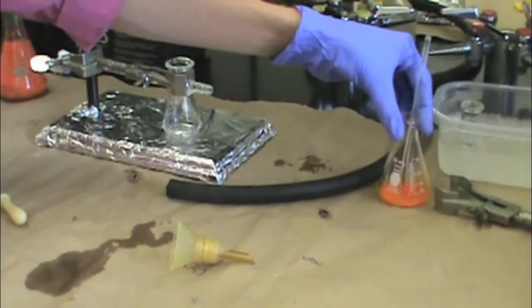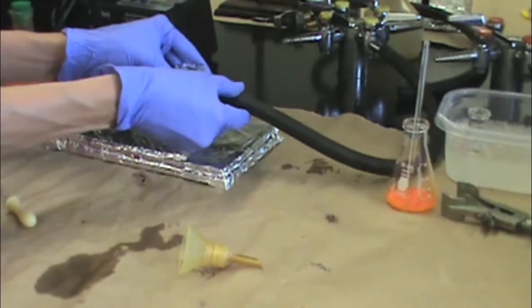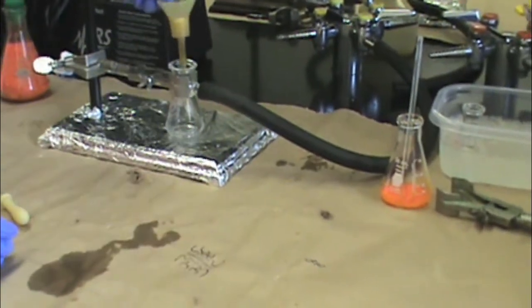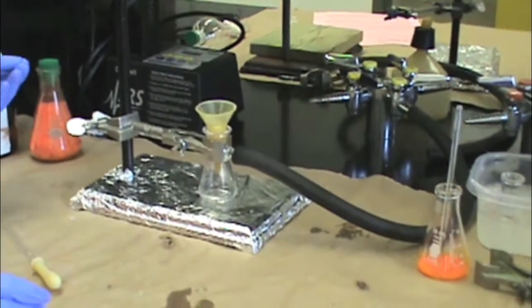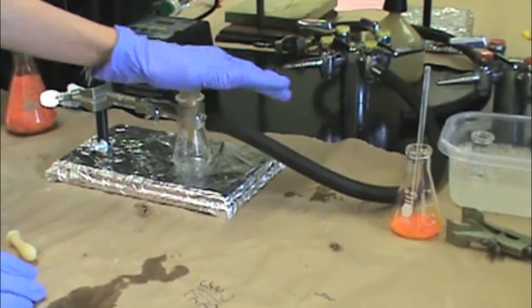Then attach your vacuum hose to your sidearm flask, put the Hirsch funnel in the flask, and turn on the vacuum. You should check that you have good suction.